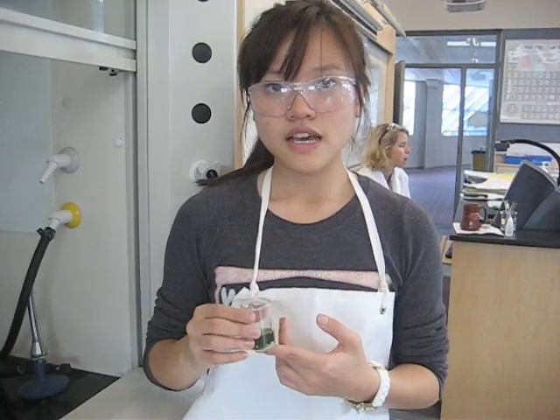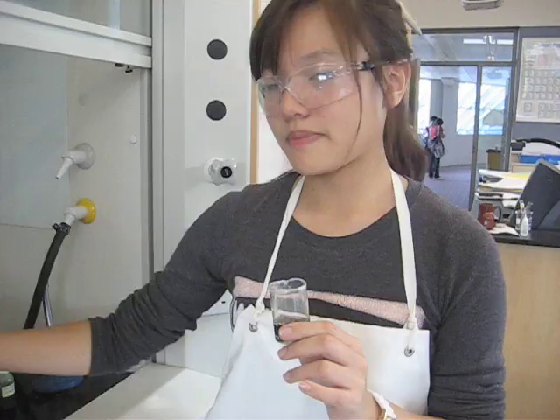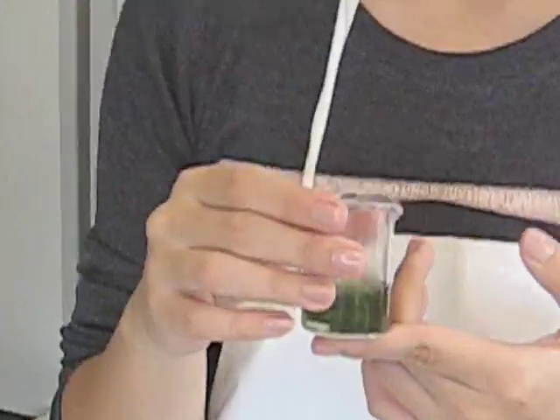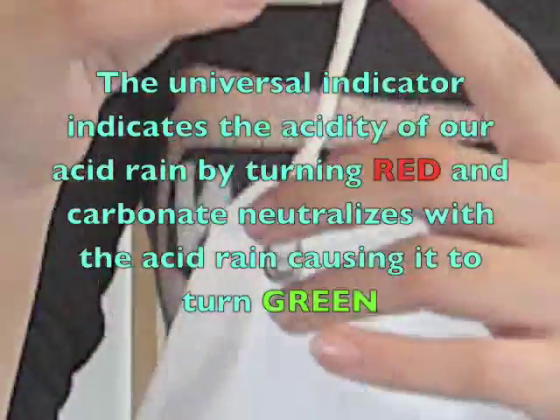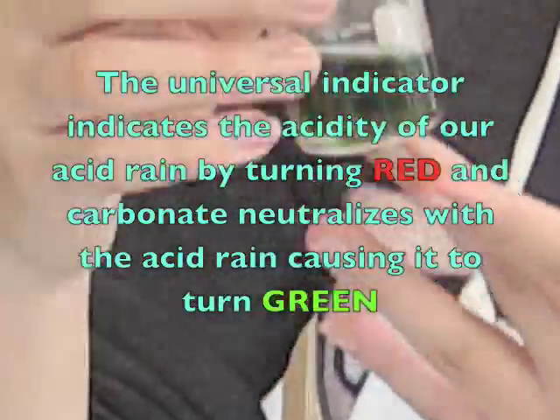And as you can see, the acid quickly turns greenish. So the solution turned with baking soda — sodium hydrogen carbonate — turned from red to green. Red is the universal indicator which indicates that it's acidic, and it turning green just means that it neutralizes the acid.